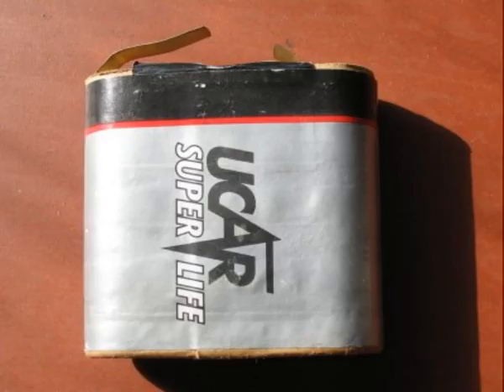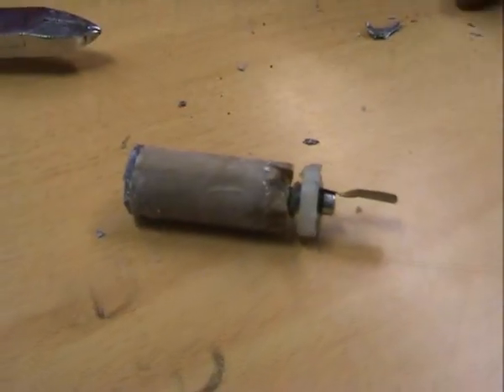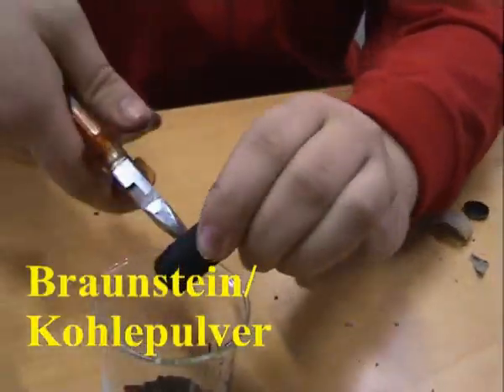First you need a battery. Make sure it is of the zinc-carbon type. Disassemble it to get out the carbon electrodes, zinc metal, and the manganese oxide.